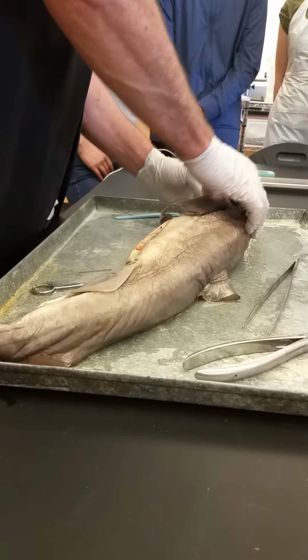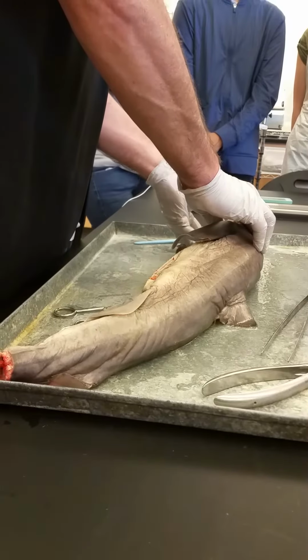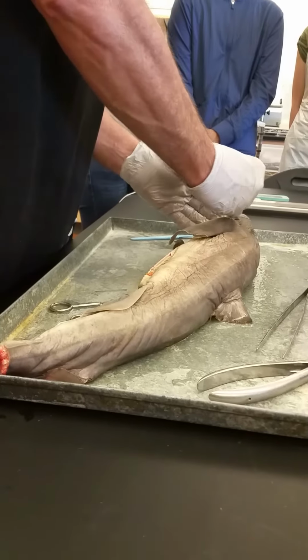Another difference is in most of the bony fish, the mouth is at the anterior end of the body. Whereas with the sharks and rays, it's underslung. It's down here on the ventral side of the head, which gives it a little more leverage.